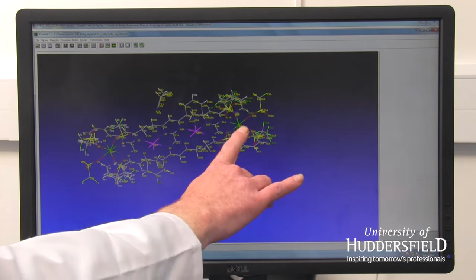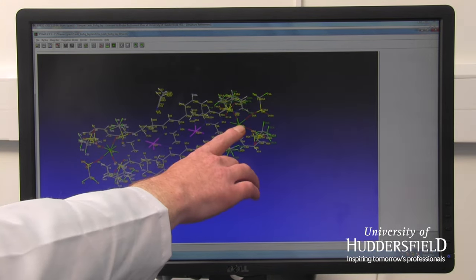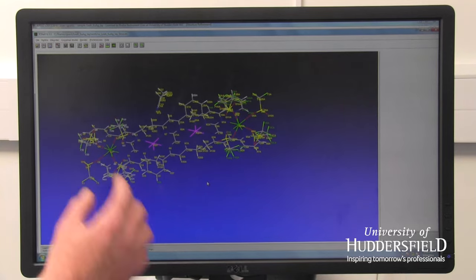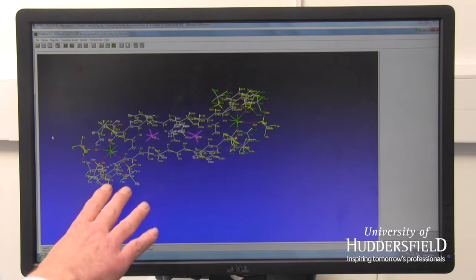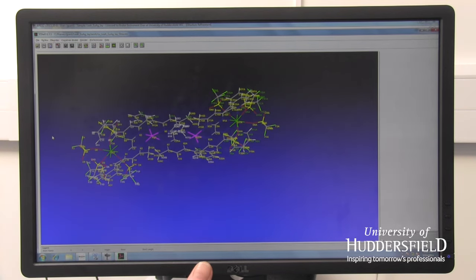You may be able to see here, we've got a europium, which is a lanthanide, a heavy metal, and another europium here. And we've got two silver atoms. From our crystal, we can work out the arrangement of atoms, the number of bonds, and what they're bonded to.